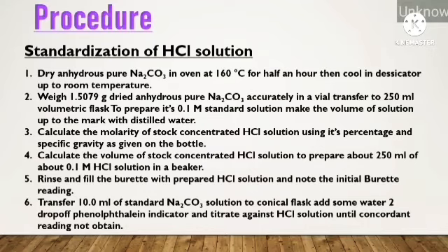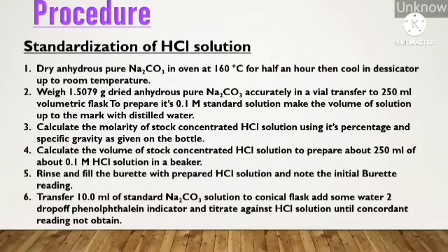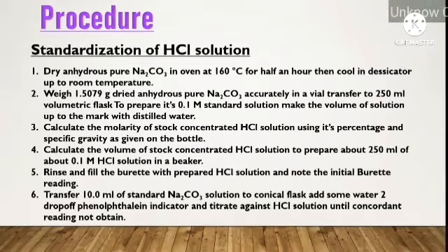After calculation by applying the formula of weight calculation, accurately weigh anhydrous pure sodium carbonate up to 4 decimals, that is 1.5079 grams, and transfer to a 250 ml volumetric flask to prepare its 0.1 molar standard solution. Make the volume of solution up to the mark with distilled water.